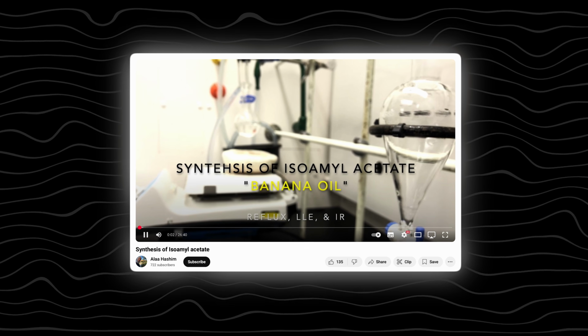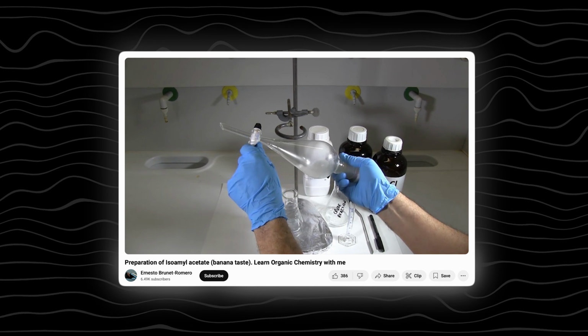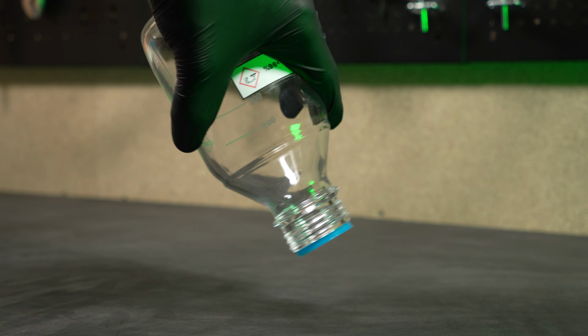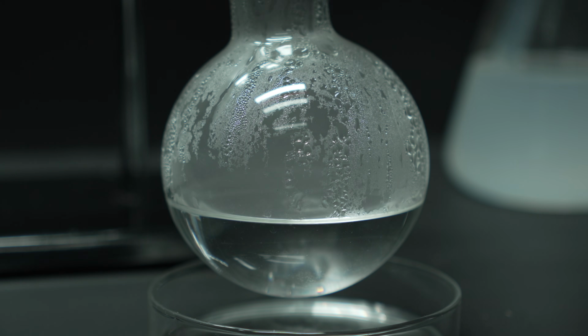Step 1. Isoamyl acetate. Attempt 1. There are lots of videos on YouTube making isoamyl acetate because it's a well-known Fischer esterification, and this reaction has one catch. A big catch. For this reaction I need concentrated sulfuric acid. Mine ran out, so I started thinking what I could replace it with, because I really didn't want to mess with distilling boiling sulfuric acid. Honestly, that's the last thing I want to do.